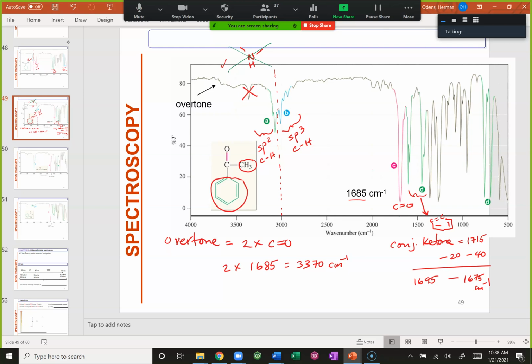Yes. And the C double bond C stretch, those peaks can have that pause in between the 4 peaks, right? Because that's what I'm seeing on this. Oh yeah, so here you'll see them 4. You have 1, 2, 3, and 4.